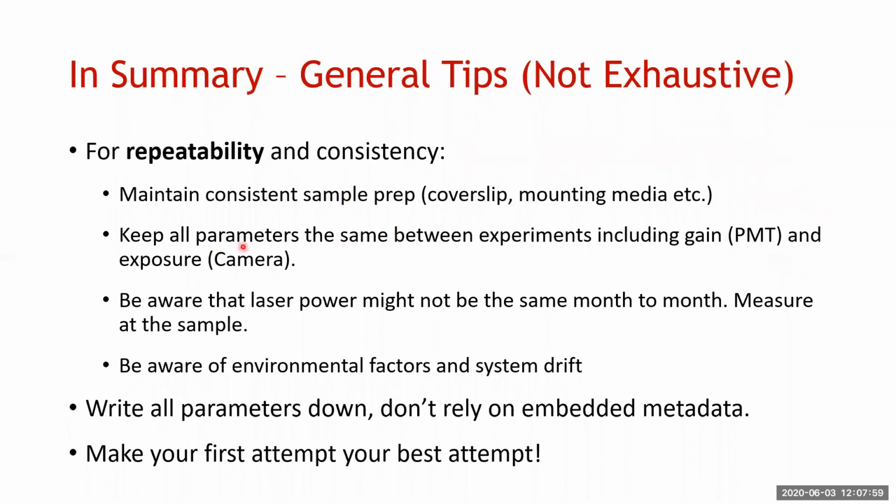That goes without saying. And that laser power may not be the same month to month if something goes wrong. Of course, we make sure that it is the same month to month. But things like environmental factors, going from winter to summer, imaging in the morning instead of the evening, imaging alone versus a full lab, this matters as well because the heat load is different. So there's a lot of things that can affect the system. We're not telling you to be paranoid, just to be aware.